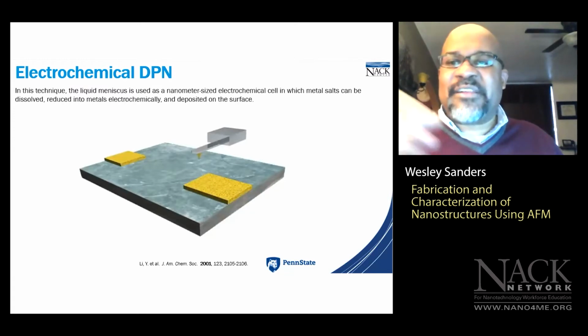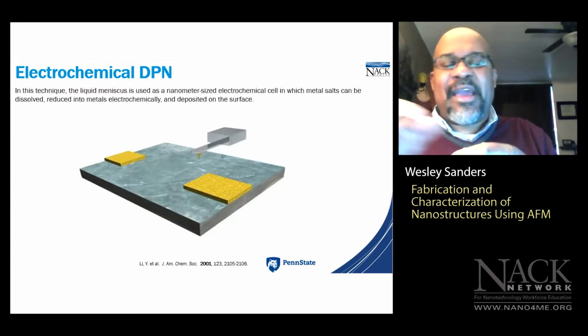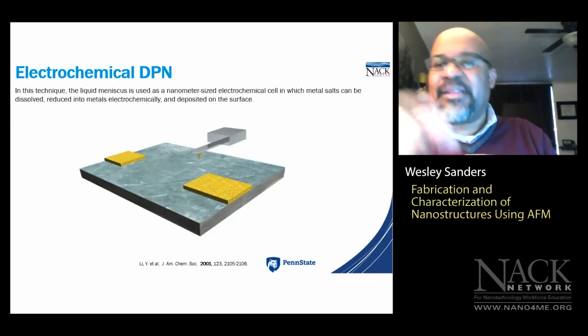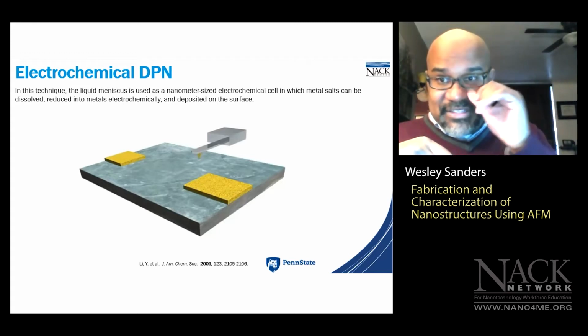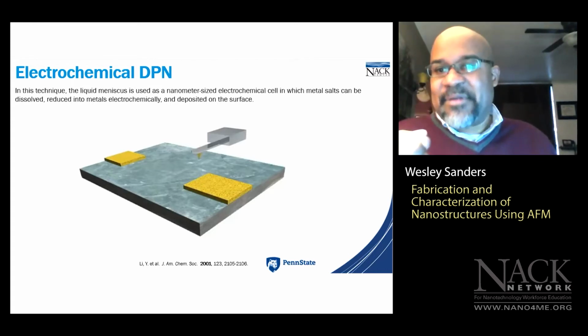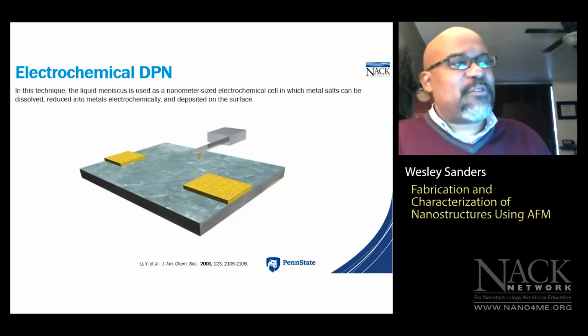A fluid cell is basically a small polymer corral with an O-ring, about maybe a 1-inch diameter, and you're able to put your substrate and your fluid of choice inside of the fluid cell. And when you lower the scanner into the fluid cell, you're only lowering the tip, right? The tip is the only thing that's immersed.